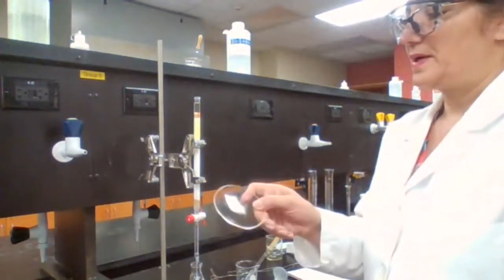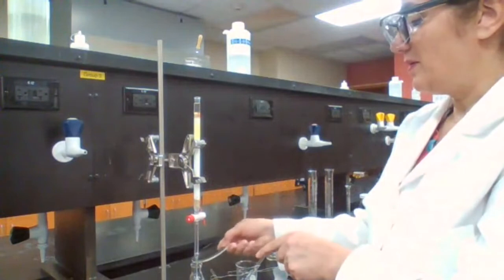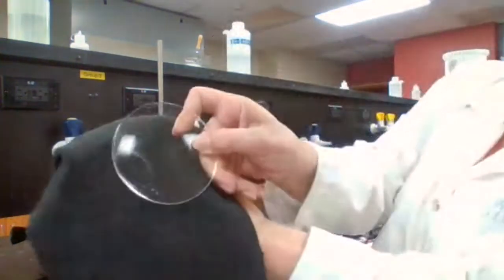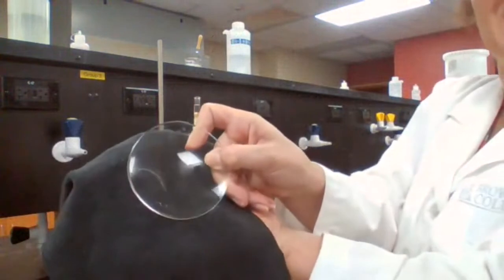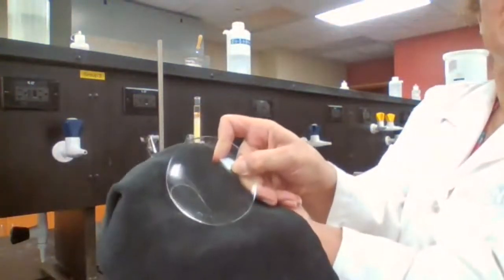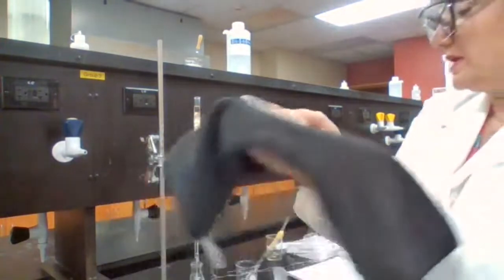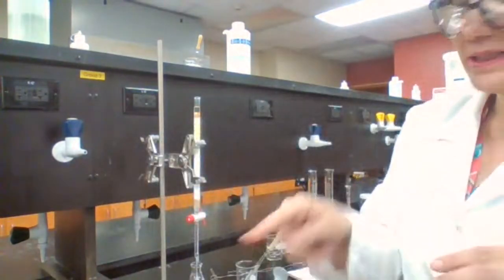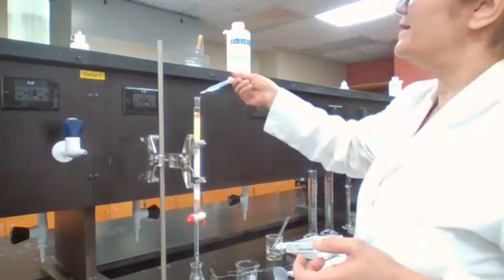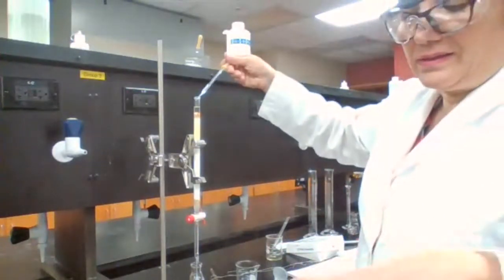So when I test it now, I see the white residue again on the glass. That means I still have the fluorene coming with the hexane. So I have a mixture, a solution. So I have to continue this, elute and test, until I see no white residue.